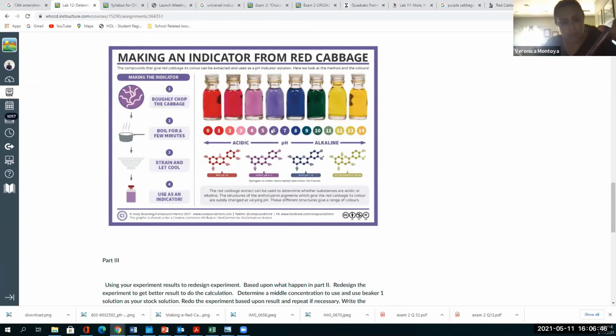Mine is number 4. Yours is number 4. Mine's the same, just a pretty lavender. Wait, we put the cabbage in the Kool-Aid now? Slow down. You're going to put a little bit of the cabbage into the Kool-Aid. Right now, because you put it in water, and if it's distilled water it should technically be at 7 pH, which should be a purplish, bluish color.